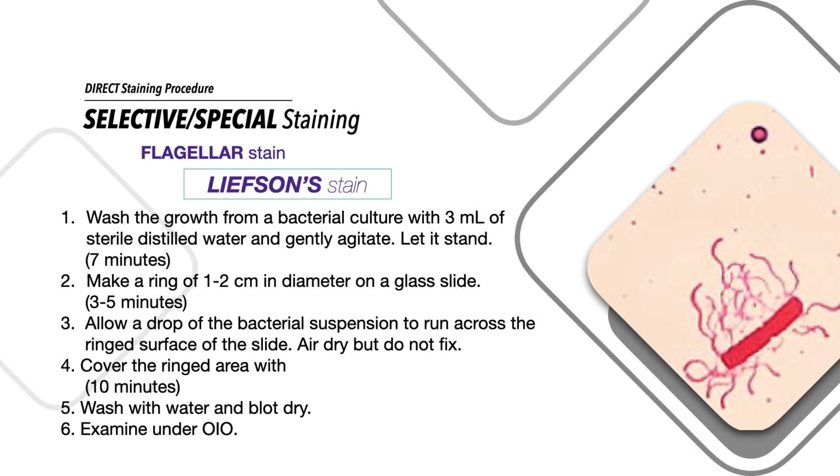Ma'am, what is the function of letting it stand? Why is it only in the flagellar stain that we let the suspension stand, ma'am? Suspension is what it's called, guys, okay? The bacterial sample plus the distilled water is called a bacterial suspension. Why, ma'am? Because by letting the bacterial suspension stand, we let the flagella unravel, okay, to really regenerate and to really extend. So it spreads out so that we can really see it once they are stained.